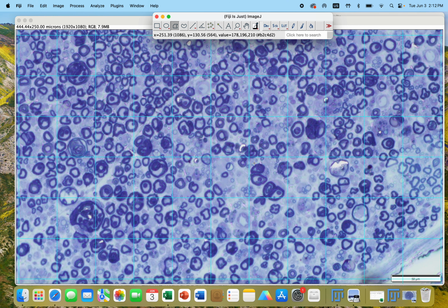Okay. We used this as a counting frame, so the area of my counting frame is 40 by 40, 1600. Now I need to calculate the area of our sampling frame, which means the area of this whole image that appears in front of me.